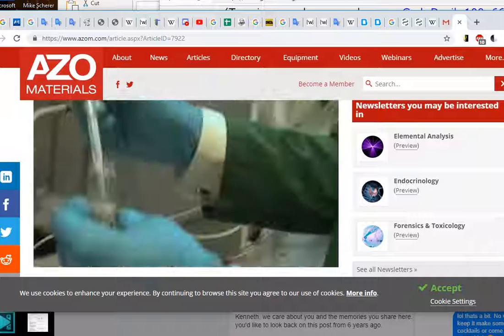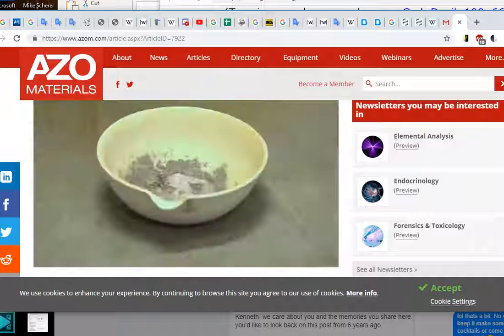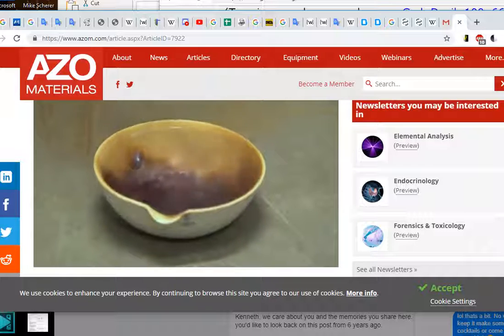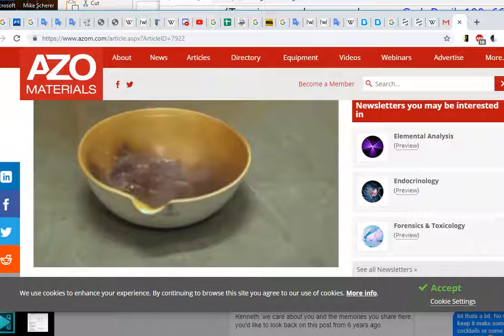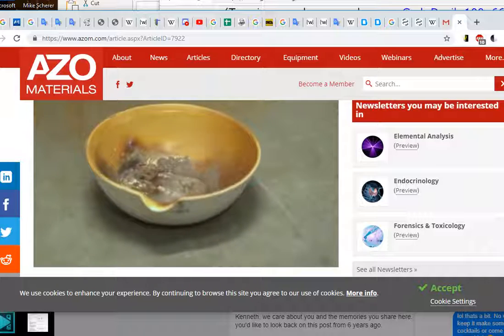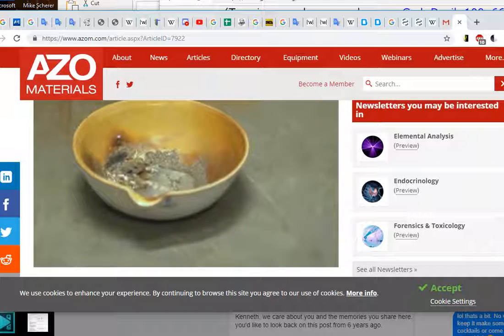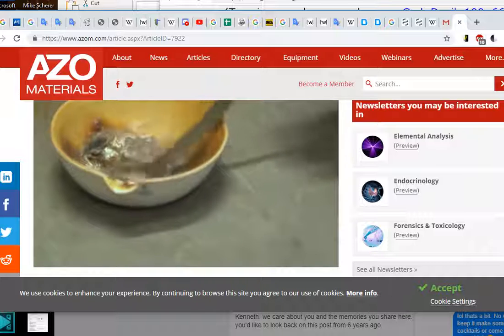Water, just take a small amount and add it to the reaction. So you can see it's starting to go now, the chemical reaction, because we're seeing the excess iodine subliming and forming a vapour. Now if we go in close, we can hear it fizzing, because this is actually the oxidation reaction and the formation of the new aluminium triiodide. Now I'm going to just mix this slightly to try and increase the rate of the chemical reaction slightly.